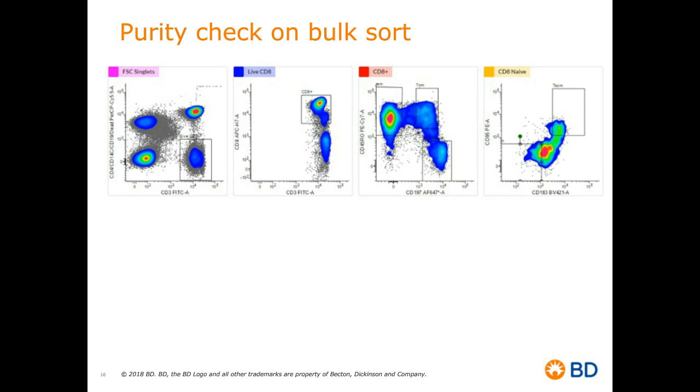go to the next plot where we have CD95 and CD183 (CXCR3). And stem cell memory T cells are defined now within this gate as CD95 positive T cells. And for this experiment, we consider as naive cells those that express low to no level of CXCR3.